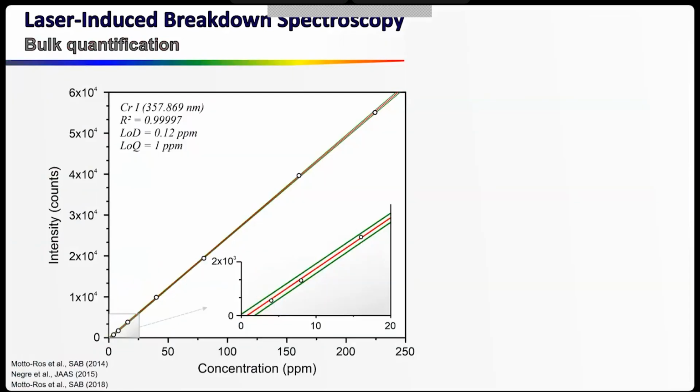But in chemistry, this is a slide that I always show when I make a presentation to the chemistry community. Because for chemists, in general, they consider that LIBS is absolutely not quantitative, because they heard that LIBS is not reproducible, etc. So I'm always showing these slides. You can do fantastic quantification with LIBS.